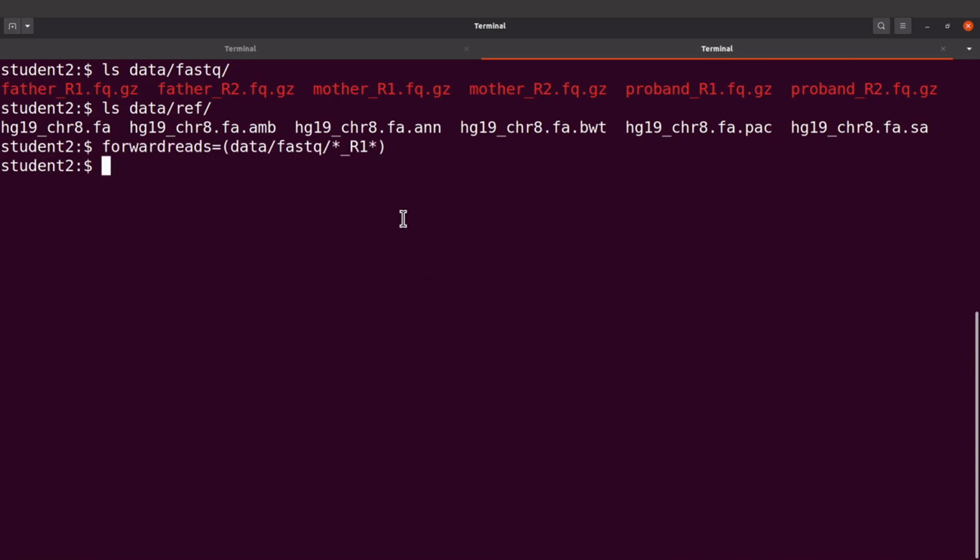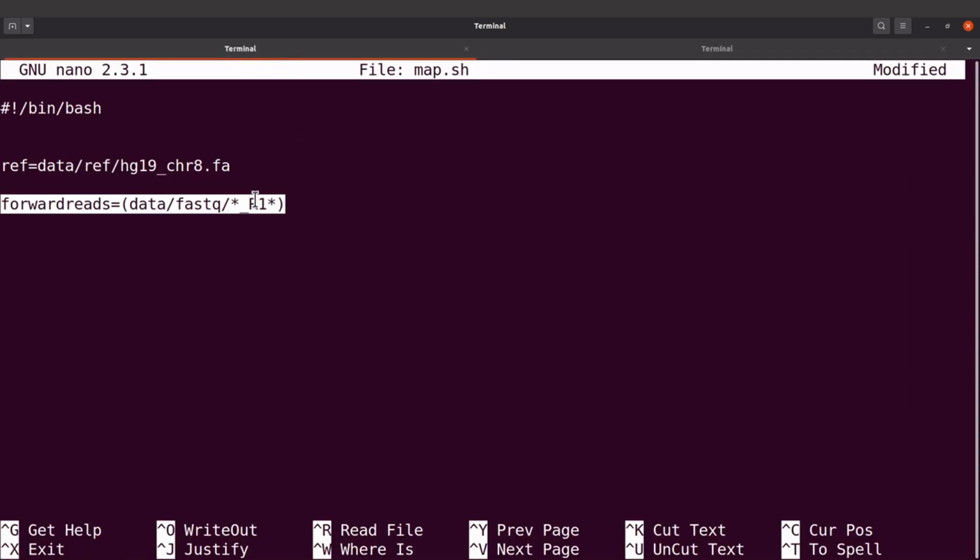Okay, I'm going to just do some tries here. So normally with the scripts, you can also do some interactive sessions whereby you execute some of the commands in another terminal to test if everything is working. So that's what I'm just doing here.